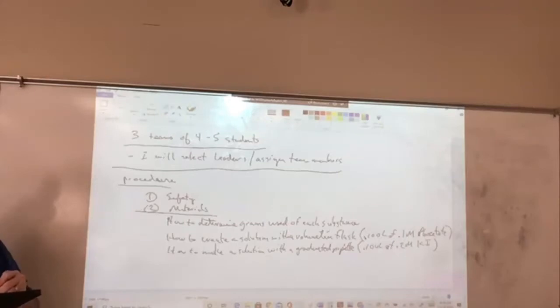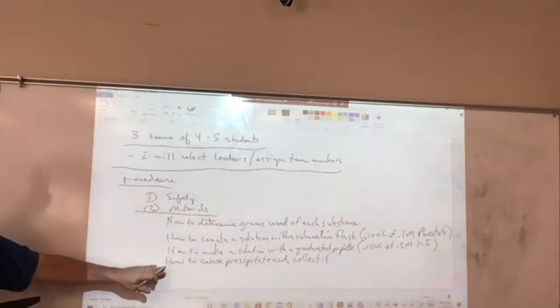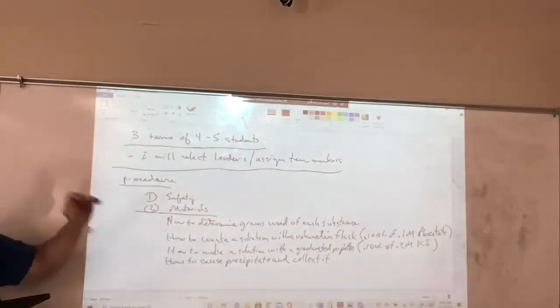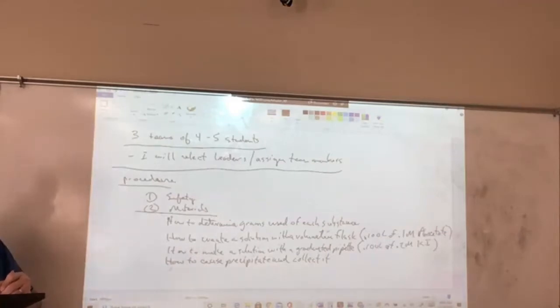Then, how to cause a precipitate and collect it. Okay, that's going to be the fourth part of your procedure. How do I cause a precipitate and collect it? And then the last part will be determine yield. Okay?